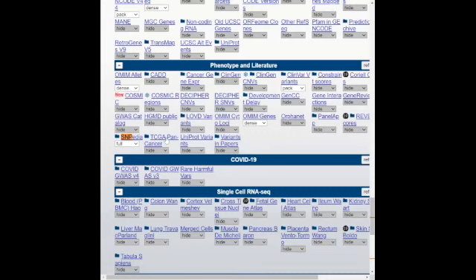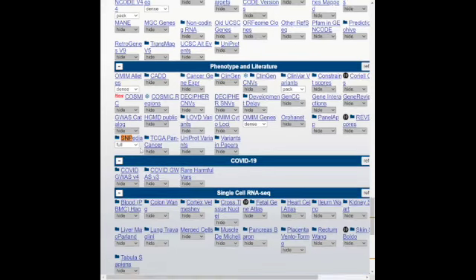When you turn on SNPedia and then dbSNP, those are actually shown up, the RSID, and then it actually shows. Yeah, thank you.